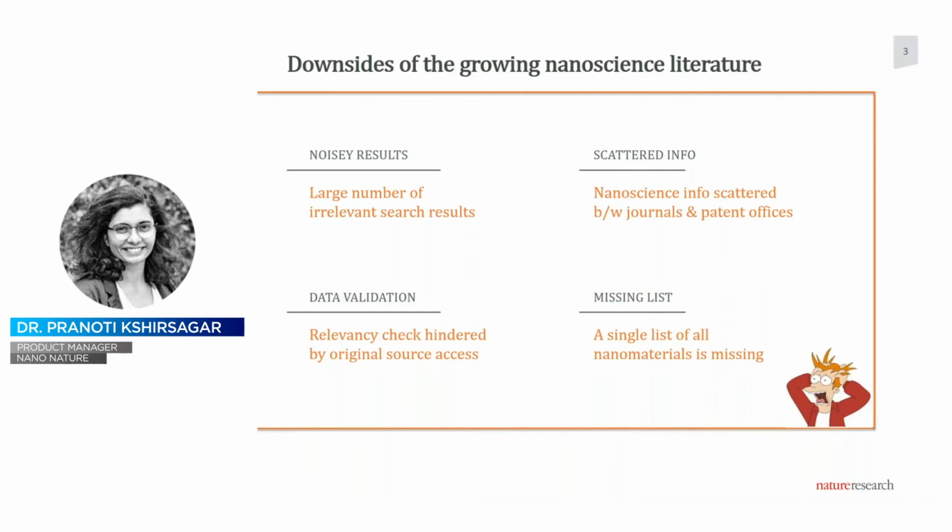However, to address these four pain points, Nature Research launched this research solution, which is Nano, so nano.nature.com. And this is the first non-journal product to come out of the brilliant minds at Nature Research, and that's also one of the many reasons why we are very proud of it.